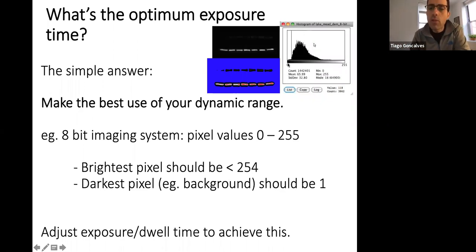And what you want to do is look at a histogram. And I think you covered these with Luke, right? So if you go to ImageJ and you plot a histogram, this gives you the count of pixels. So this is 0. How many pixels are exactly at 0? And how many pixels are at 255? So this will be absolute white. This will be absolute pitch black. And there are these gray levels in between.